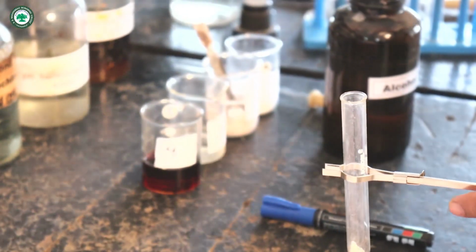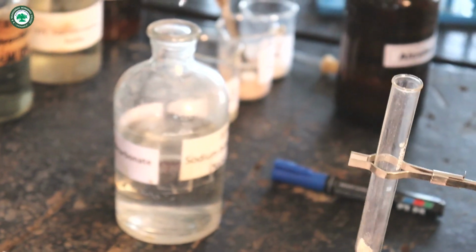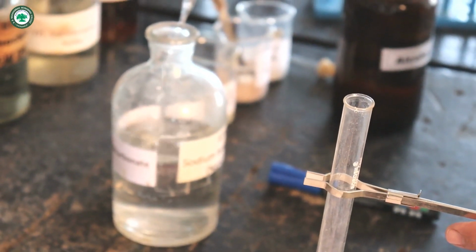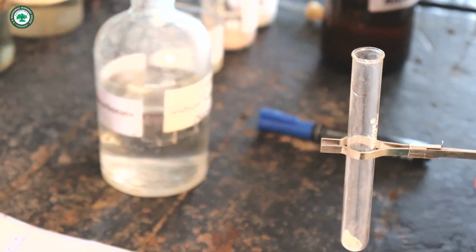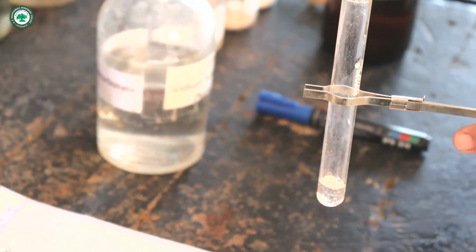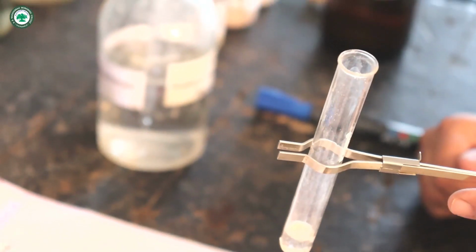Then add sodium bicarbonate solution. Observation: there is no brisk effervescence of CO2.